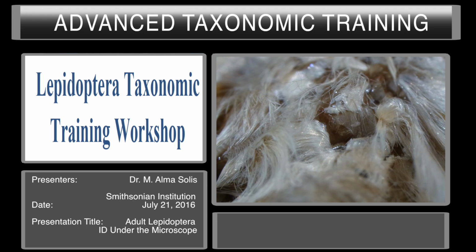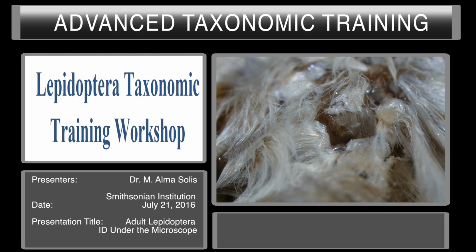Of course, all of these can be seen by removing the abdomen, and if you do that, then it's best to put the abdomen in a glycerin vial to keep it with the moth. I should also say, if the proboscis is smooth and it's not a geometroid or a noctuoid, generally, but not always, if the moth is small, then it's going to be a Microlepidoptera, which includes the Tortricoidea. If it's very large, it's going to turn out to be something like a bombycoid, which you should be able to see just by looking at the moth externally.